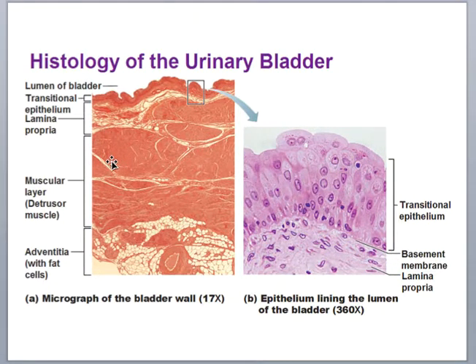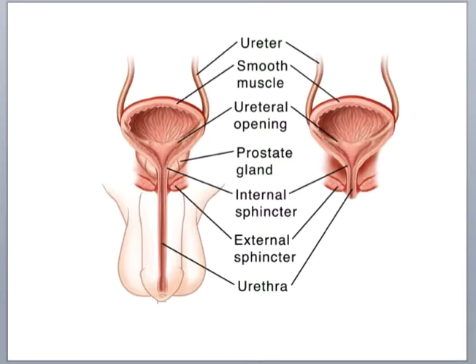If I'm asking the detrusor muscle of the bladder, I will make sure that you can see transitional epithelium so that you know that you're in the bladder. This is to show you, as the ureters come down and enter into this region called the trigone, and it fills the bladder with urine. The bladder serves as a temporary storage compartment for urine, and then once ready, the bladder will contract and you will eliminate your urine through the urethra.